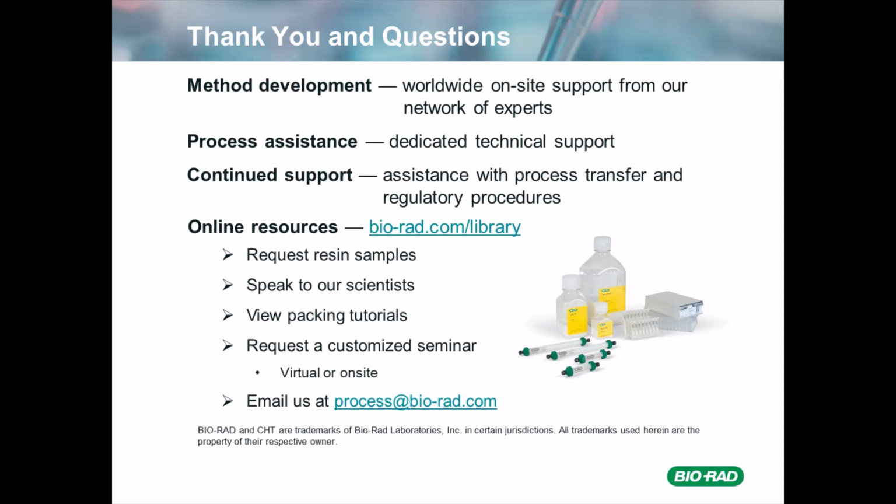Okay. And do you recommend performing repeat efficiency testing if the adapter is lowered to reduce headspace? Oh, after it's packed originally, yeah, that's not a bad idea, because you're going to want to know where you are at that point, just to keep everybody happy.